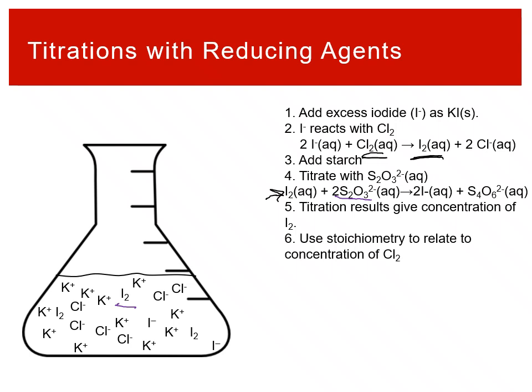Iodometric titrations are what we call these. You really want to titrate chlorine, but that's hard. So instead you do a more complicated process with more complicated calculations, but it's an easier titration because the titration of iodine is at least straightforward and possible because of starch. You can get that really sharp color change. With chlorine, you're just not going to see much of a color change at all.